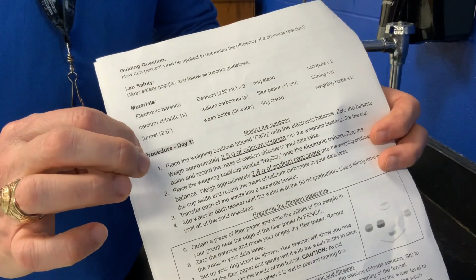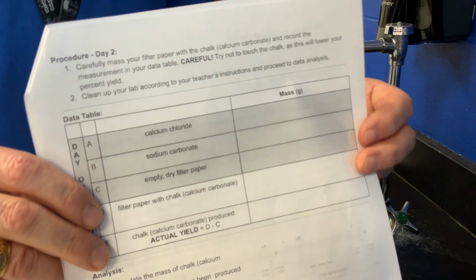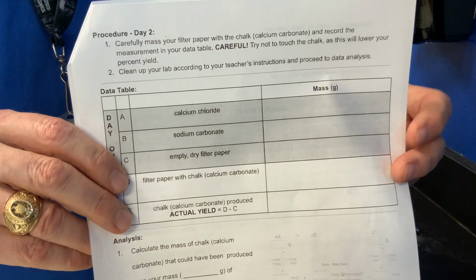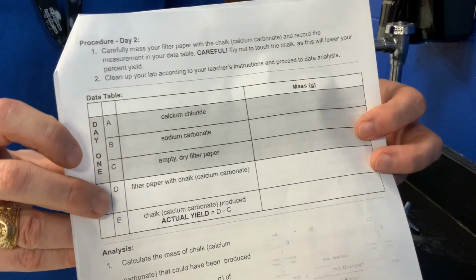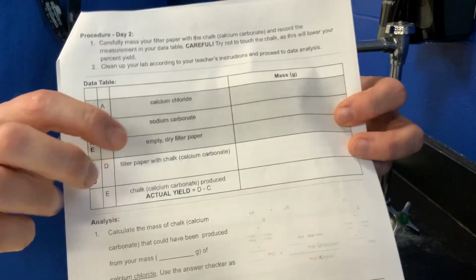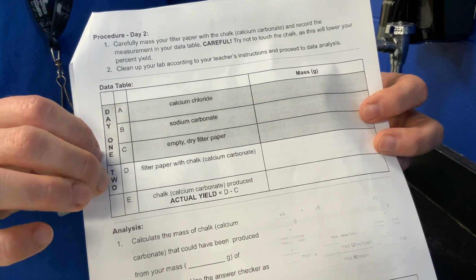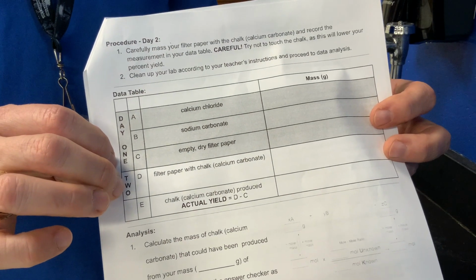Notice that procedure day 1 has got a gray highlight. If you turn it over, you will see the data table also has a gray highlight and is clearly labeled day 1. All of your day 1 data goes here. If you are missing any of this, you will have no data to draw conclusions from on day 2.